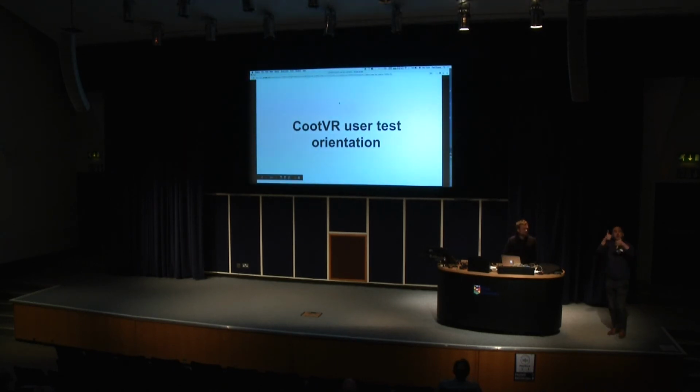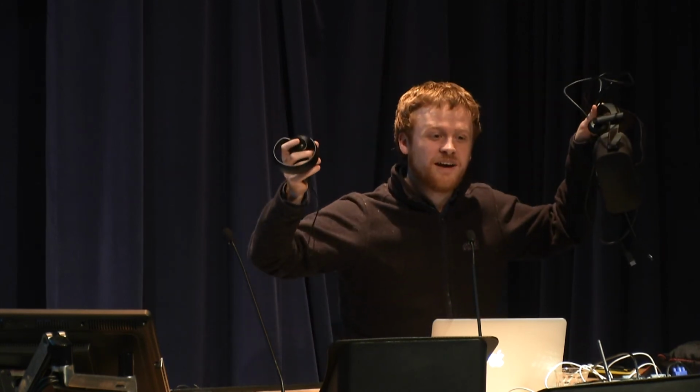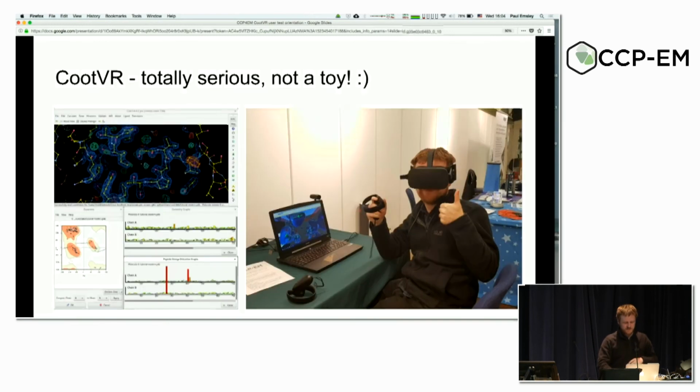Okay, thank you very much, Paul. Great. So what I'm presenting here, I'm afraid to say no flashy demo. I do have these, but they're props. I'm not actually going to be using them. What I've got here is essentially just what it is useful for you to know if you're going to see the demonstration that's behind that wall over there. It's just outside.